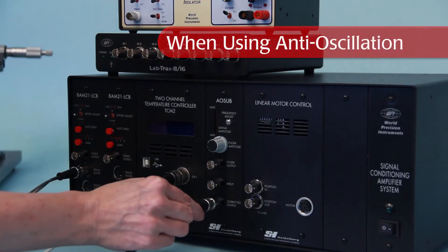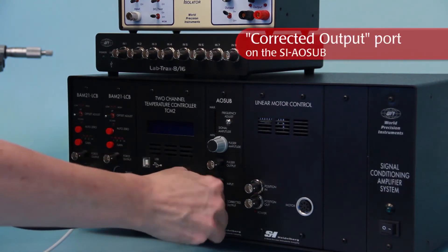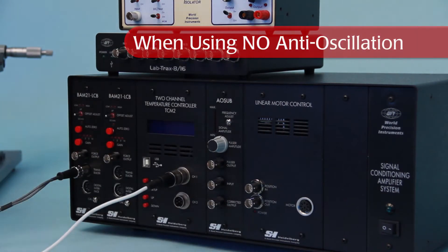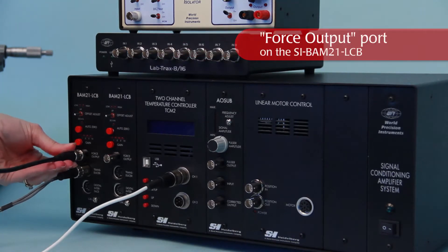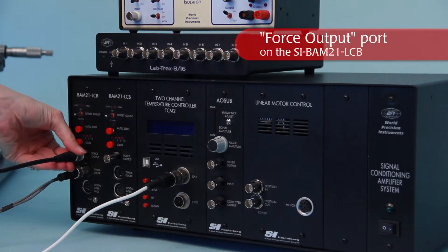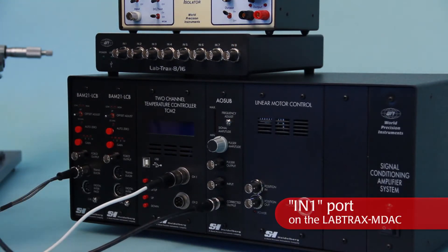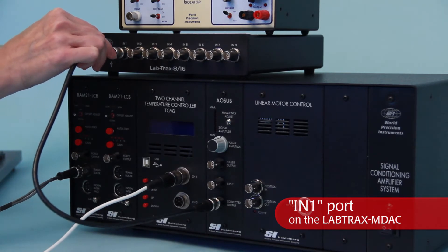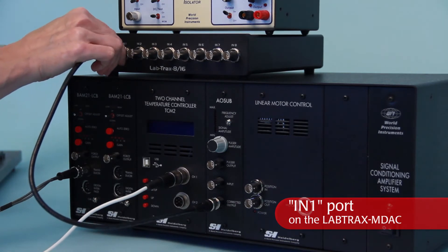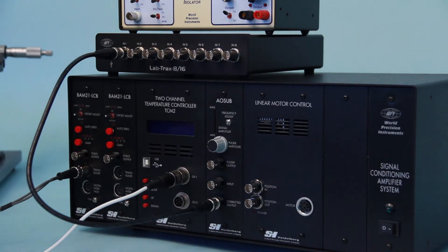If an anti-oscillation module is used, connect a BNC cable to the socket labeled corrected output. If an anti-oscillation module is not used, connect a BNC cable to the socket labeled force output on the front of the BAM21 amplifier. Connect the other end of this cable to the analog input on the data recording device designated as the force recording channel, like the IN1 connector on the Labtrax MDAC.